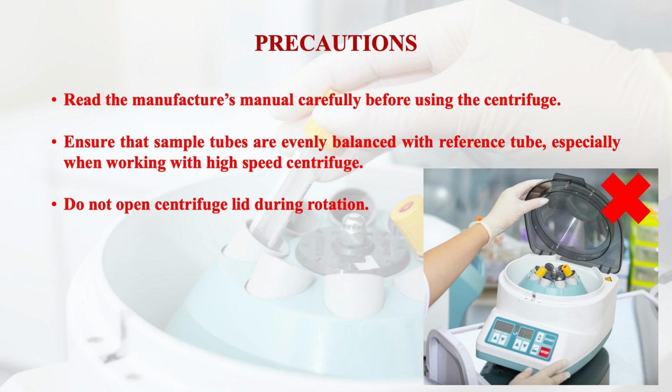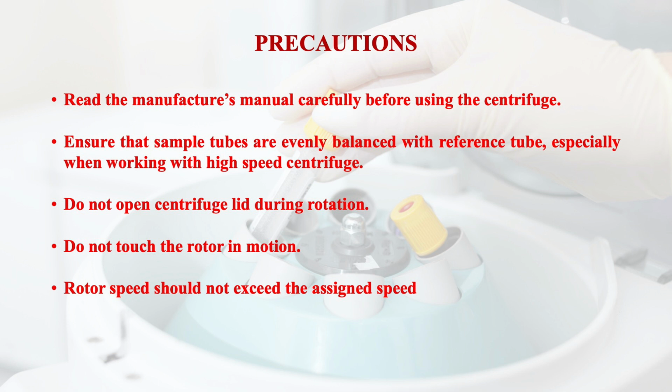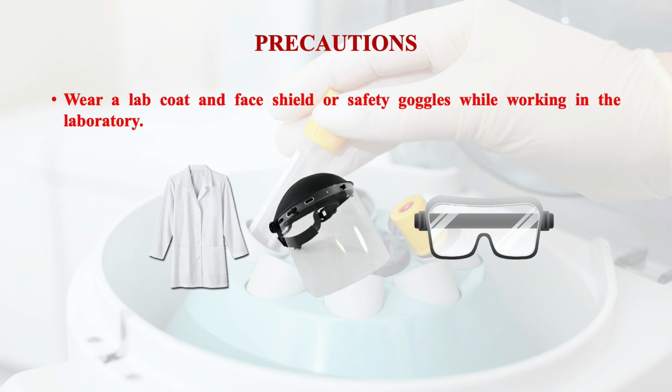Do not open the centrifuge lid during rotation. Do not touch the rotor in motion. Rotor speed should not exceed the assigned speed, and rotors and centrifuges should be kept clean and dry during storage. Wear a lab coat and face shield or safety goggles while working in the laboratory. These are the basic precautions we must follow during the separation of biological samples in the centrifuge.